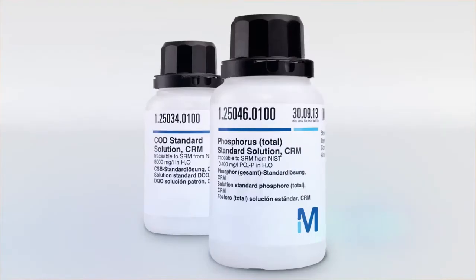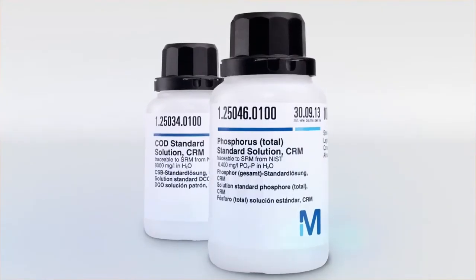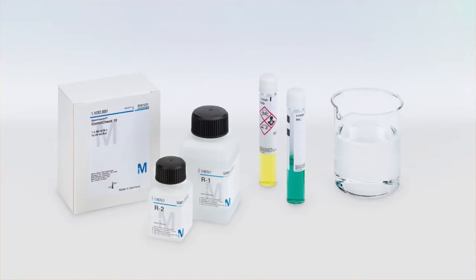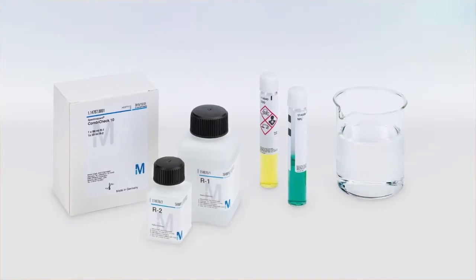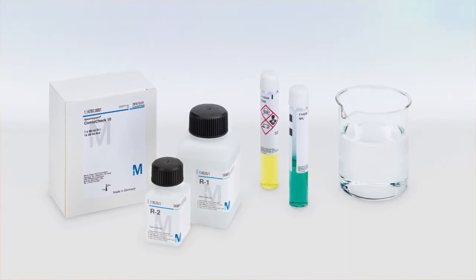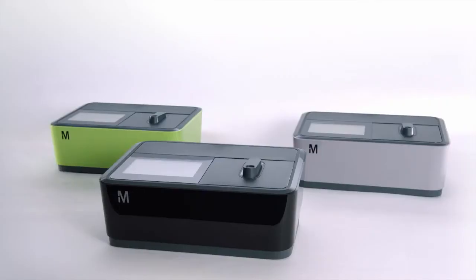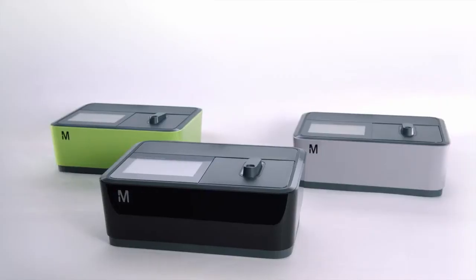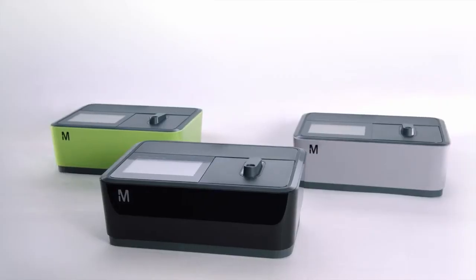To see the protocol of a specific AQA, simply tap your desired method in the list. All CRM standards and combi-check solutions offered for AQA tests are pre-programmed on SpectraQuantProof.